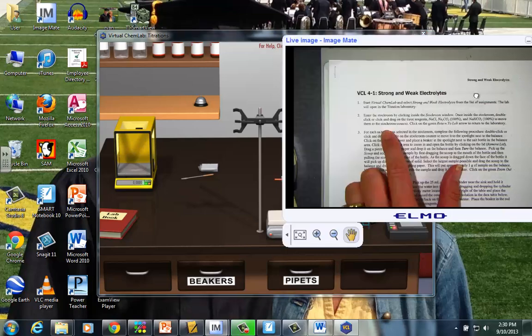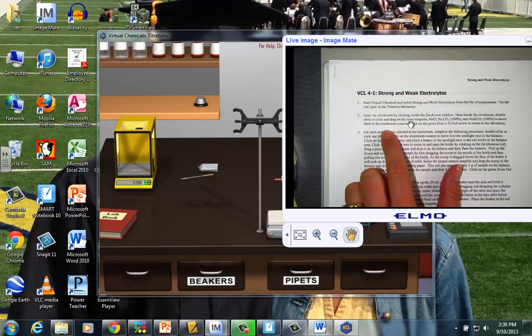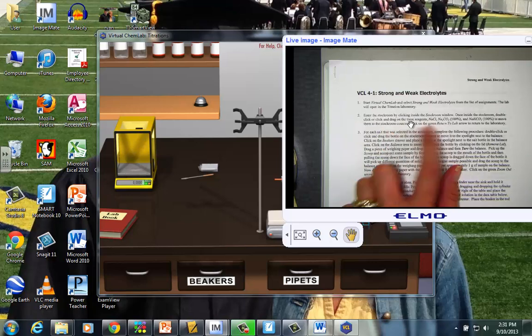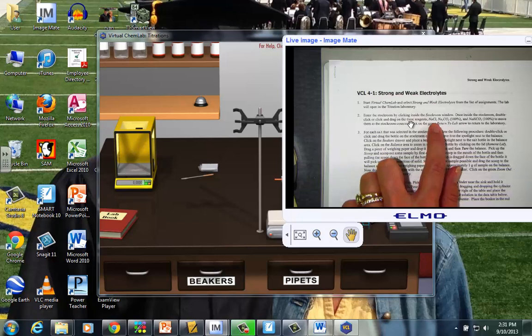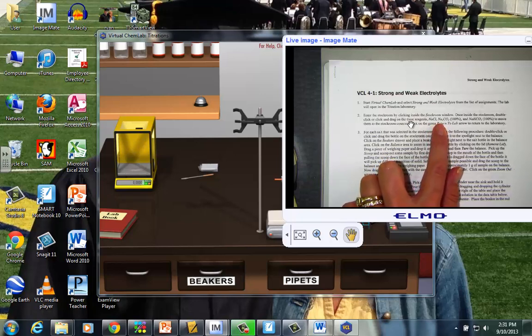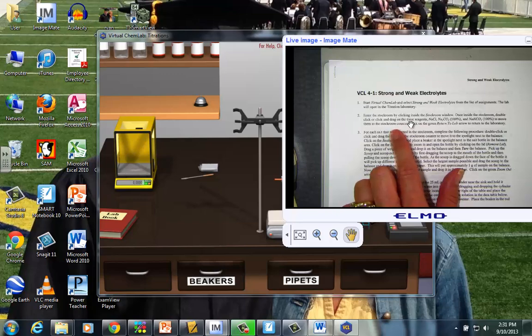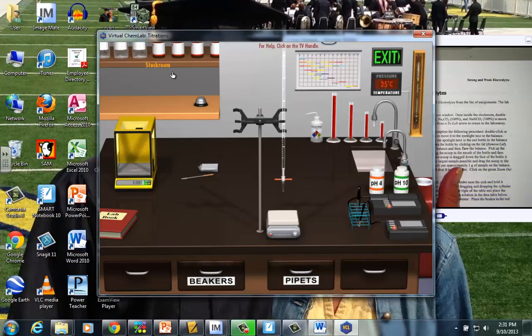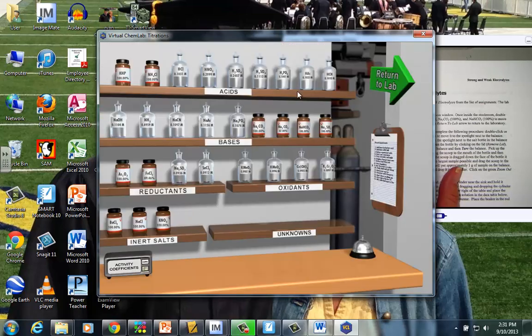So now your screen probably matches mine here. Step number two, if I look over here, it's saying enter the stock room by clicking inside this stock room window, and then once there, start looking for the reagents. We're going to need sodium chloride, sodium carbonate, and sodium bicarbonate. So we're going to go into the stock room by clicking over here. And just giving it a second to catch up. And now this is the screen that you've got.